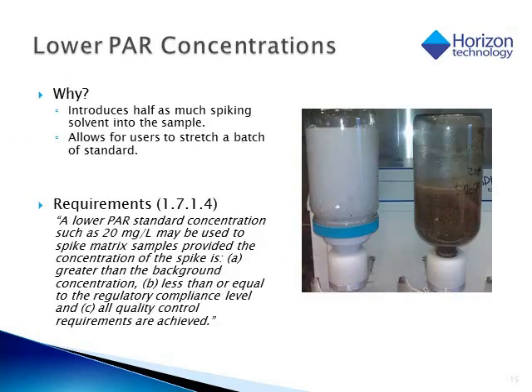Once we've established the extraction technique, the next step is to talk about spiking precision and recovery standards. Now, the method calls for 20 milligrams each of hexadecane and stearic acid to be added to the sample. But for those people who make their own standard or who purchase a vial containing multiple aliquots, it's convenient if they could spike less so that the cost per sample decreases. According to the method, this is fine.